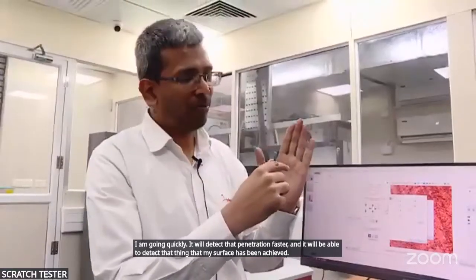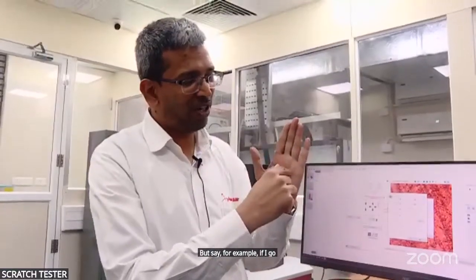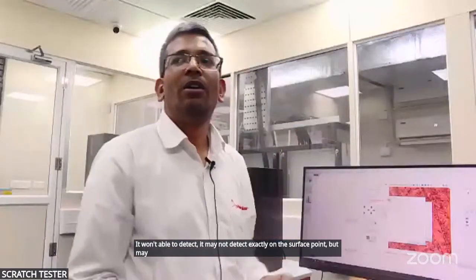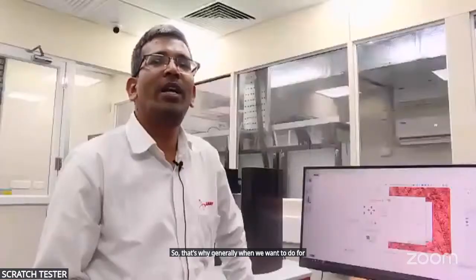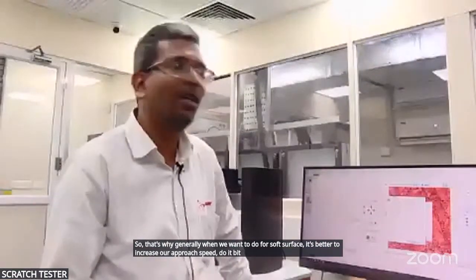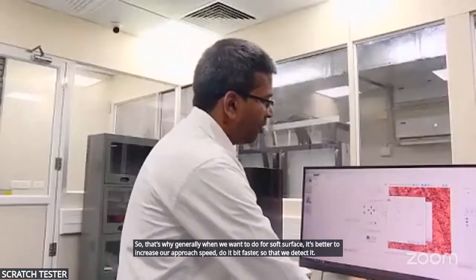But say for example, if I go very slowly, it may not detect exactly on the surface point, but may go a bit beyond. So that's why generally when we want to do it for a soft surface, it's better to increase our approach speed, do it a bit faster, so that we detect it more accurately.